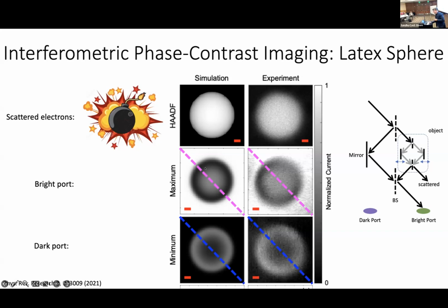So this is the phase contrast that we would expect for a perfect phase object. If we shift one of these mirrors, then there's now a relative phase introduced in this interferometer, and we start getting output into this other port, and those are like our inelastically scattered electrons. Those are literally electrons that scatter to some other detector, and so we can model this, toying with this idea of modeling this as shifting one mirror or both mirrors symmetrically.